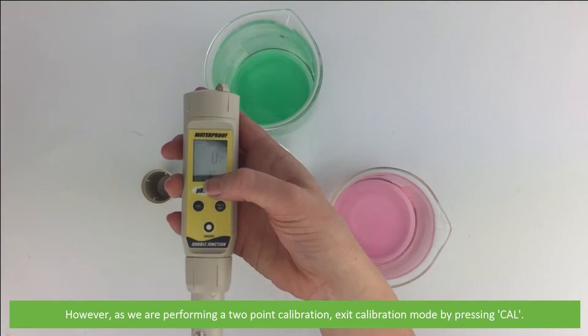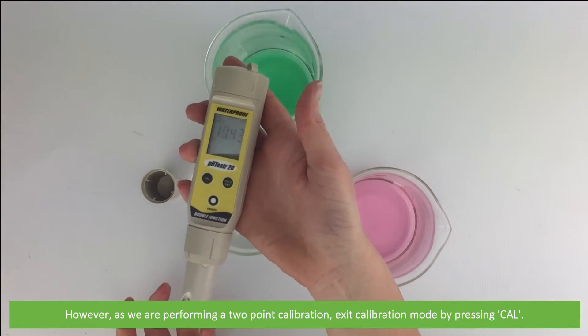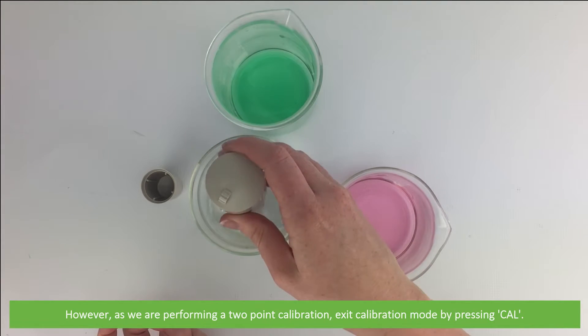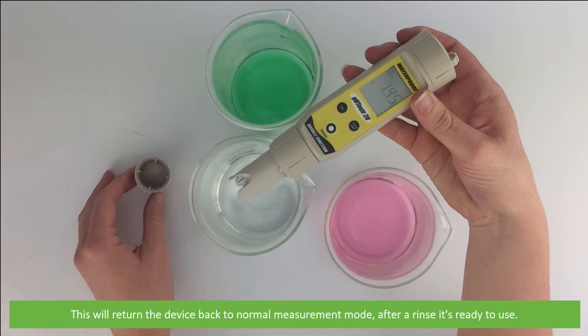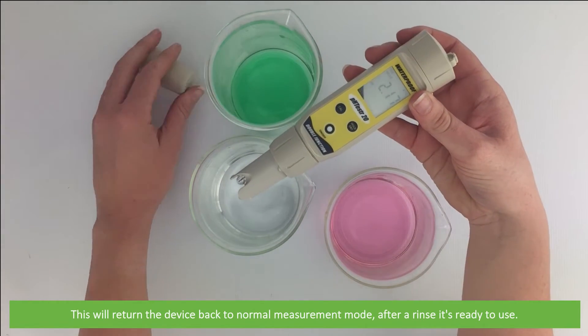However, as we are performing a two-point calibration, you can exit calibration mode by pressing Cal. This will return the device back to normal measurement mode. Then after a rinse, it's ready to use.